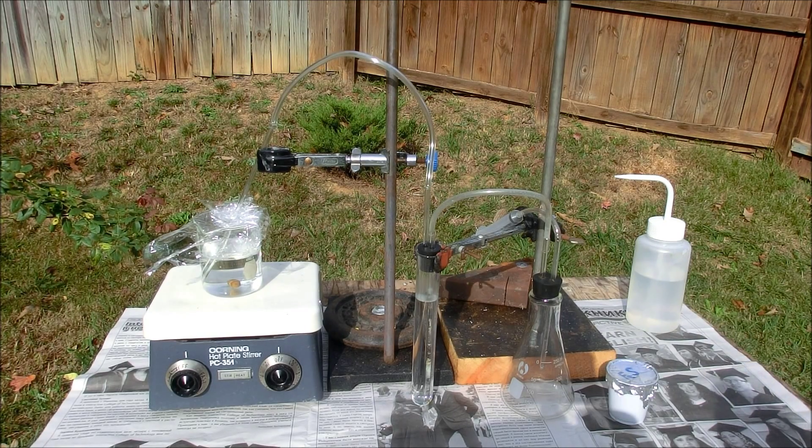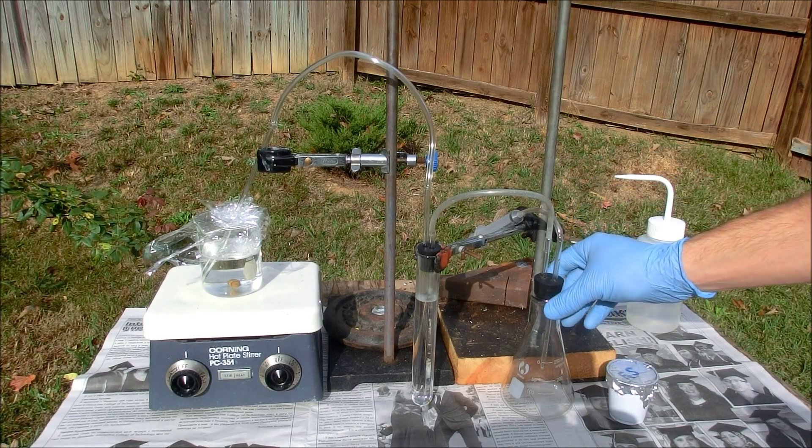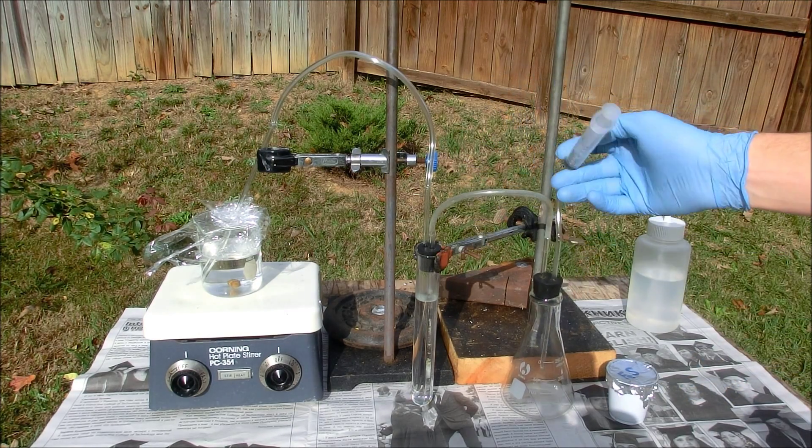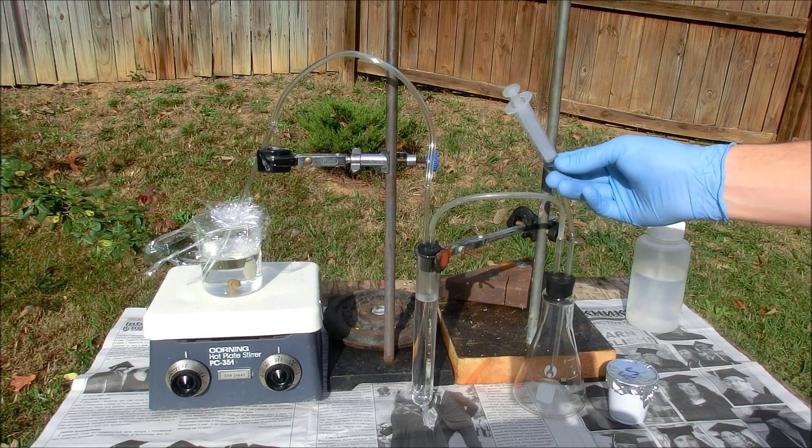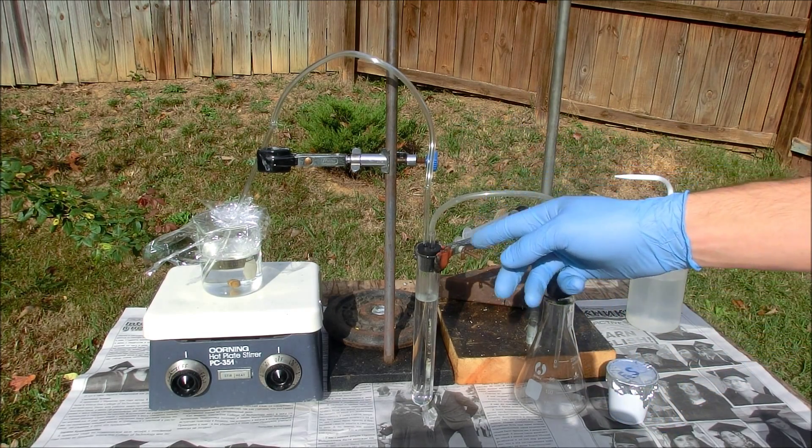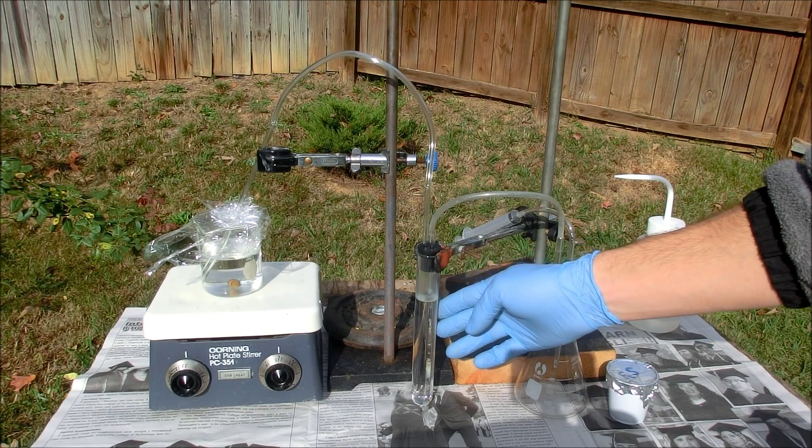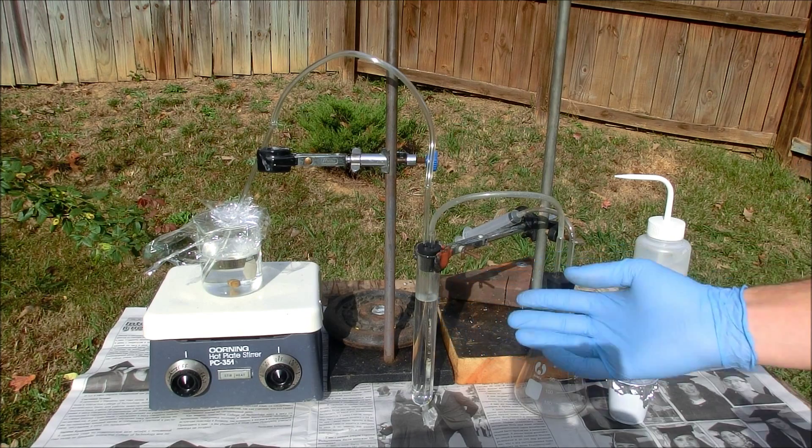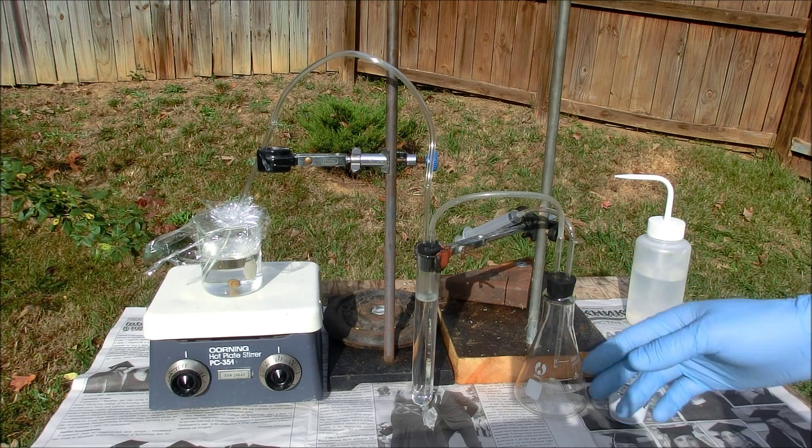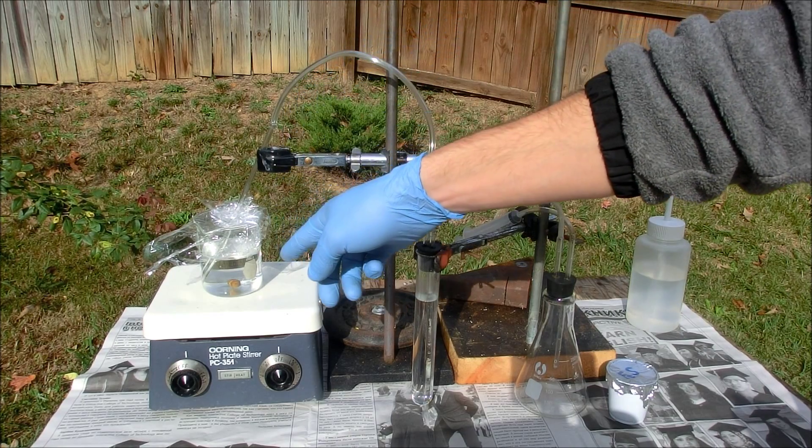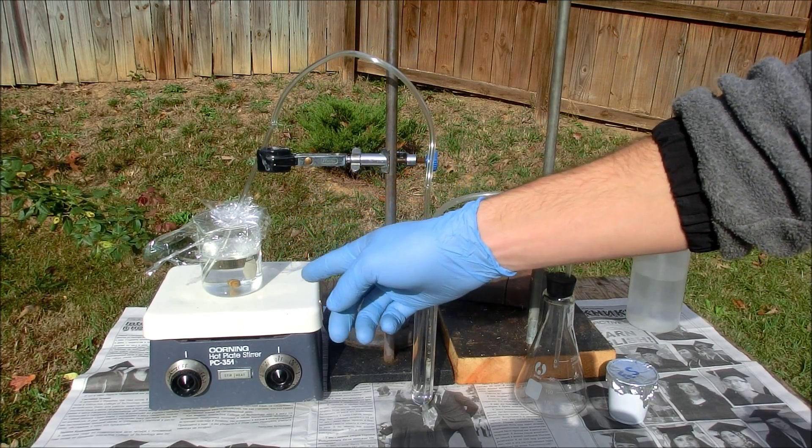So here's my gas generating setup. Here we have an Erlenmeyer flask to which we'll add the iron sulfide and then introduce hydrochloric acid through the syringe. That will make hydrogen sulfide gas which will travel through this tube to this stage which is just distilled water. It serves to wash the hydrogen sulfide gas of any HCl vapor or fumes. And then it will come up and go through this bubbler into our sulfate solution which I have a stir bar in and we'll be stirring while this is going on.